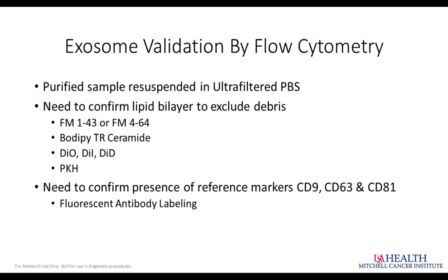Once you're going to do that staining, now we can say, what's debris, what's a true lipophilic potential exosome? Now we're going to use antibodies to look at 3 gold standard reference molecules, those being CD9, CD63, and CD81.